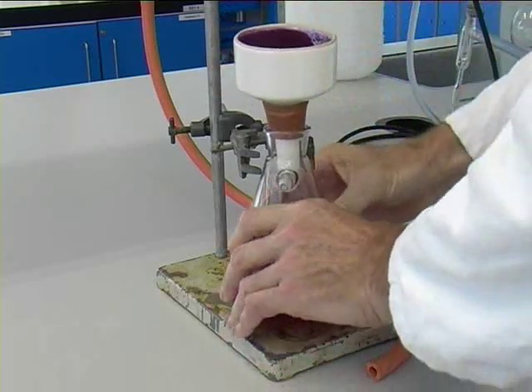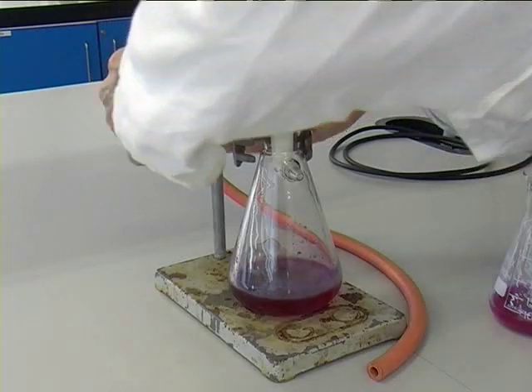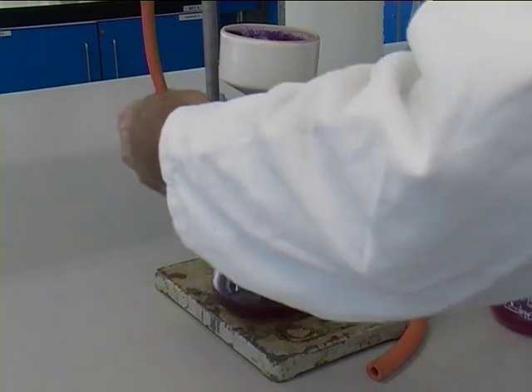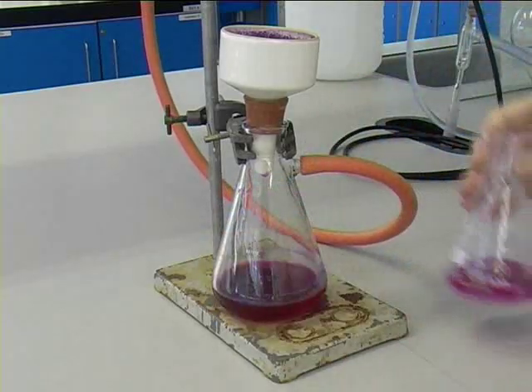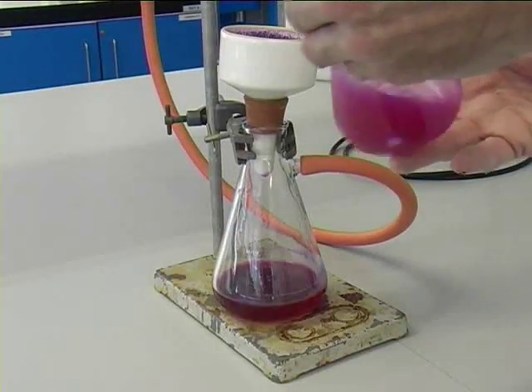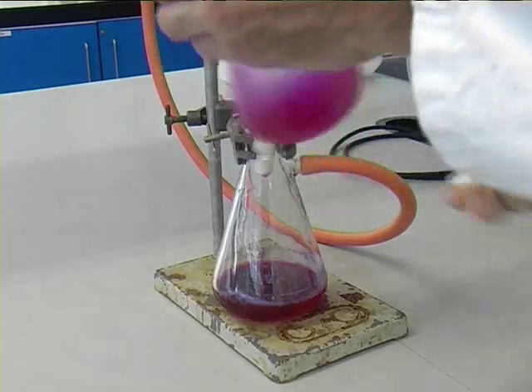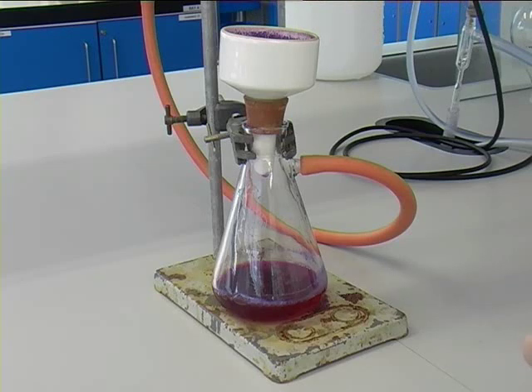Then reassemble the Buckner filtration equipment, taking care to ensure it is fully clamped. Reattach the rubber hose. Give the conical flask a good swirl, turning on the vacuum tap, and again, like before, quickly pour in your solution.